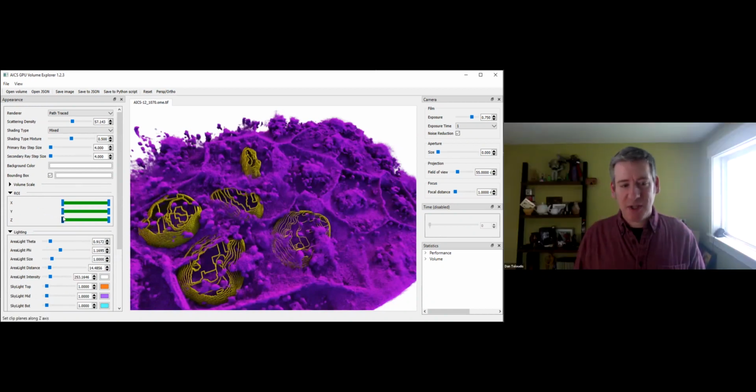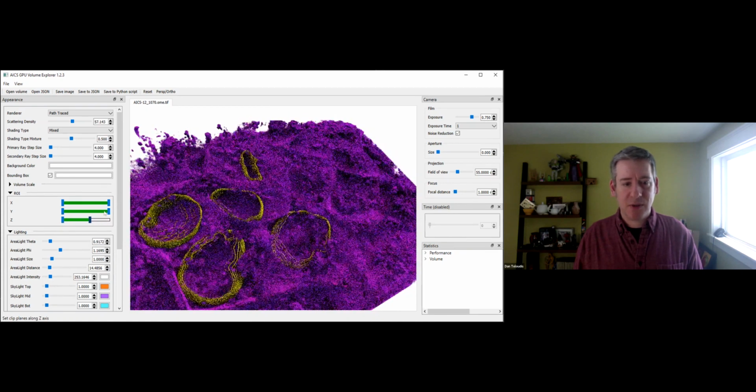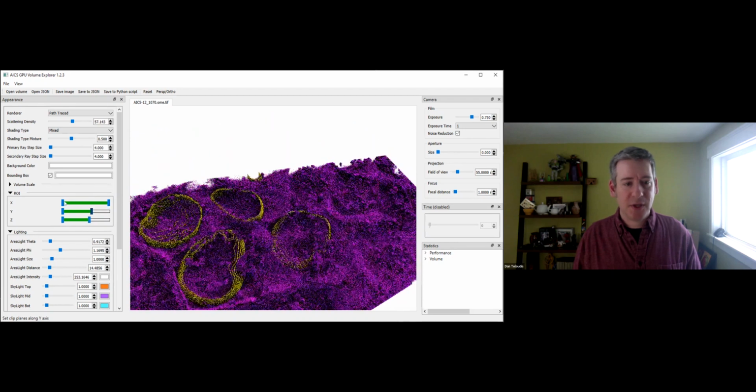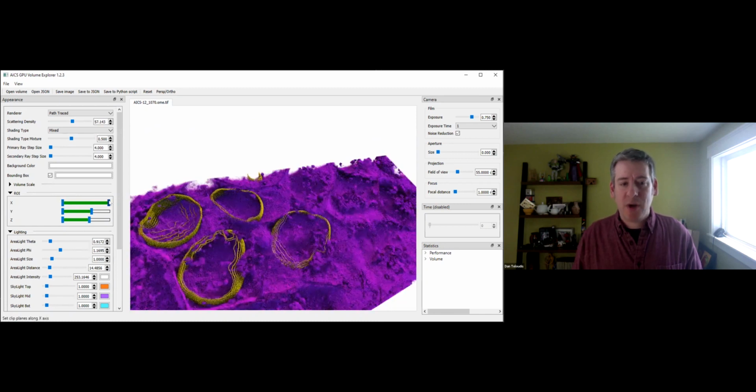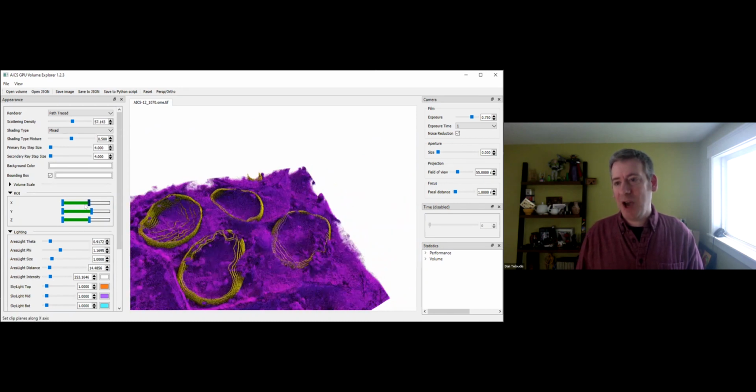Cropping for visualization is possible. That's built in here. So we can just move these sliders and start to construct regions. Export is not an option here. The tool is really sort of an endpoint for visualization, and the output of the tool is currently intended to be just pictures. It's a big discussion we've had. We know that a lot of these tools also build in analysis features and quantitative analysis features, and it's sort of a matter of where we want to evolve the tool, and user feedback helps drive that too.